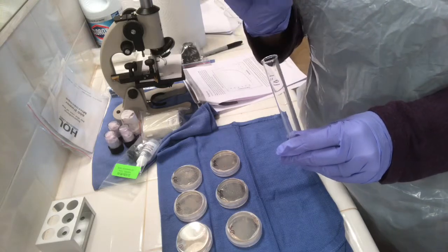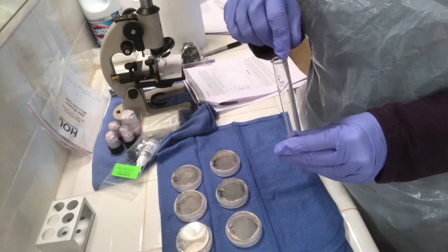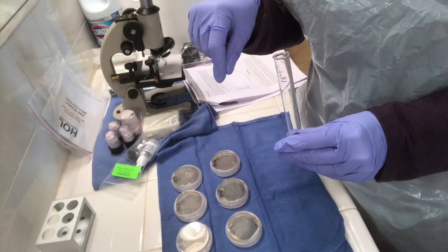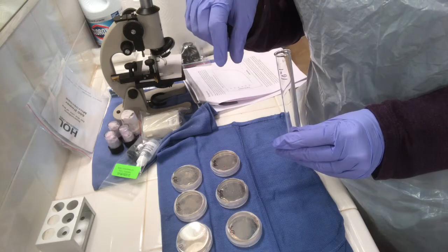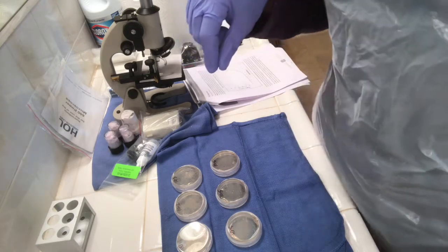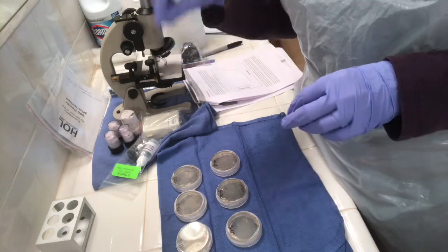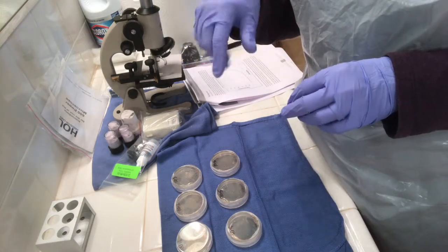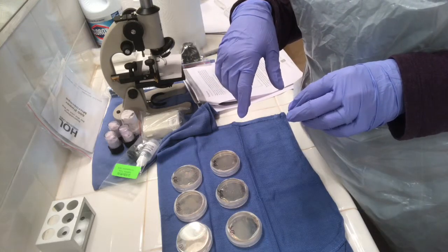And then from 10 to the 1 to 10 to the 2, 0.25 milliliters of this solution went into the second test tube. And from 10 to the 2 to 10 to the 3, 0.25 from the 10 to the 2 tube went in there, serially throughout, so that as we went further along the test tubes, the solution would be diluted.